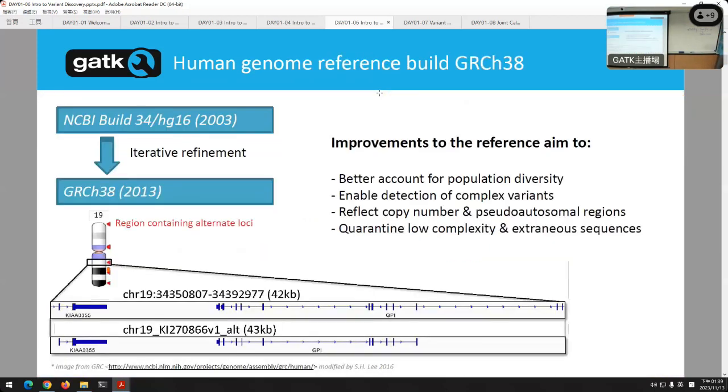The details of the slide, you can read them through if you want, but the most important thing is that we always look at sequencing relative to a reference. Human reference, a cow reference, a pig reference. It is not a person, but it's an amalgamation. It's a combination of many people. The human reference, the original one, was actually 5 different people from different ethnicities. Africans and Asians and Caucasians, I think, all went into making the reference.